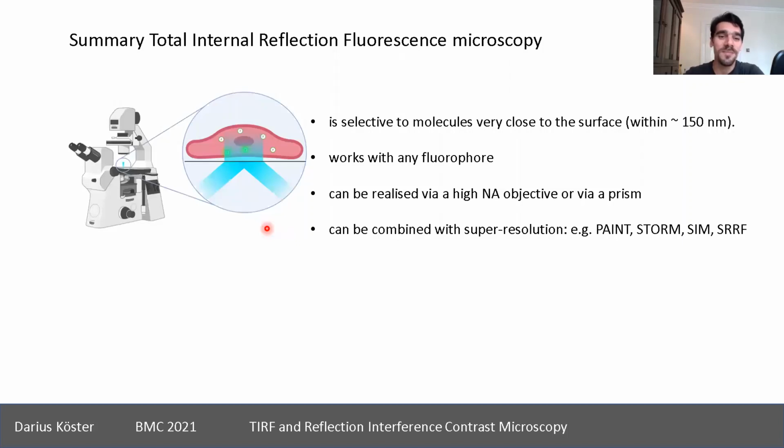So I'm definitely not claiming this was an exhaustive summary and overview of TIRF, but I hope I could give you a little bit of the background of the fundamentals behind TIRF and what to look out for. Just to summarize again, it's a very nice technique to look at surface-specific reactions or surface-specific questions.